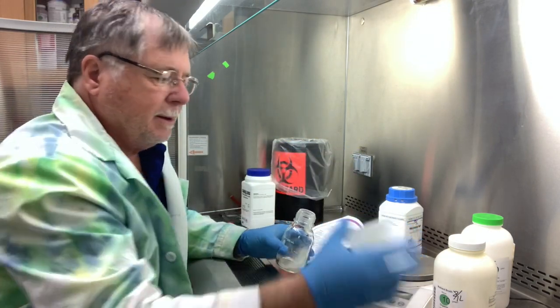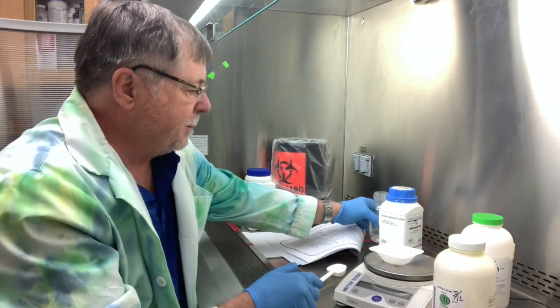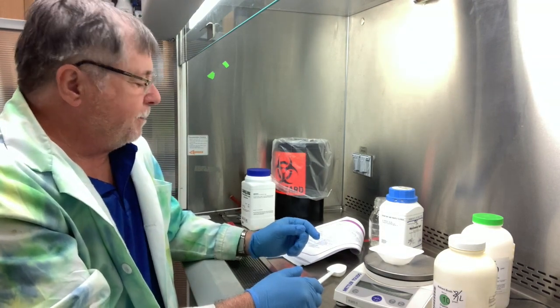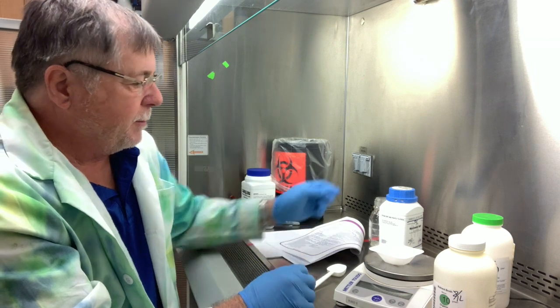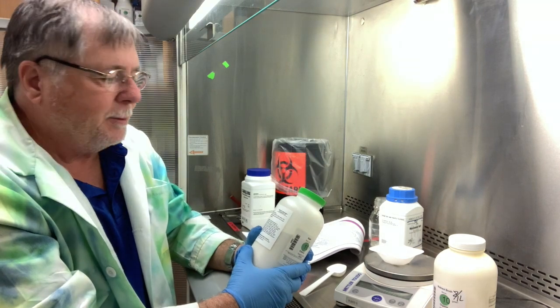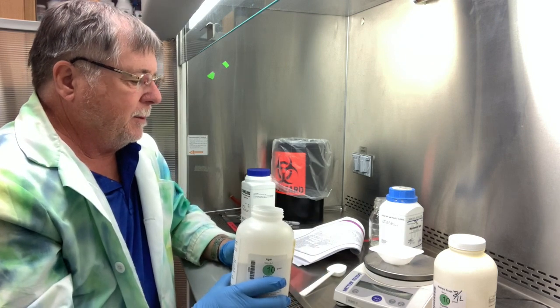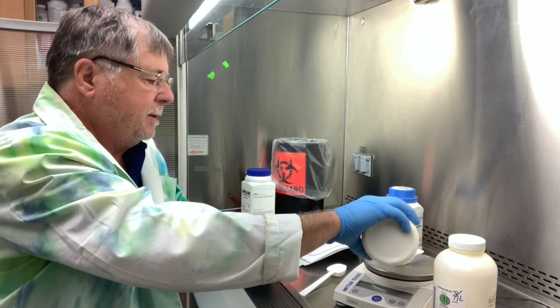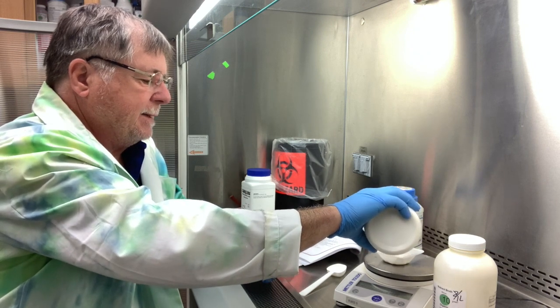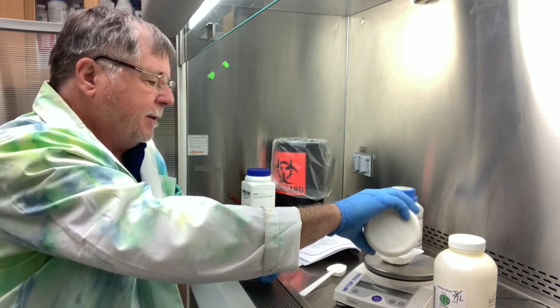Okay, so that's done, and then we get a new weigh boat. I'll use the same one for discussion purposes, and then we're going to add agar. The recipe for agar calls for 18 grams per liter, so a tenth of that would be 1.8 grams. So we'll just do that. We tare it out. So we're zeroed, and then we put 1.8 grams. Again, it doesn't have to be exact, but within a tenth of a gram.